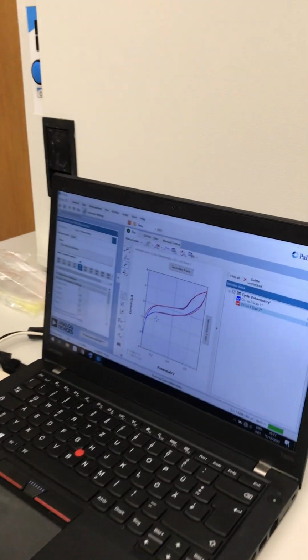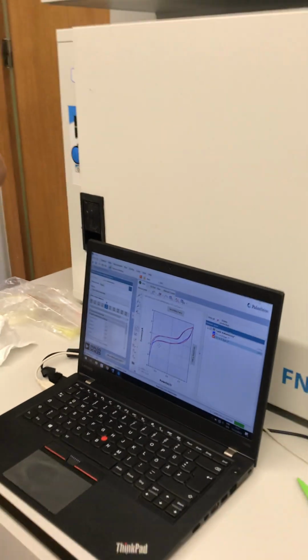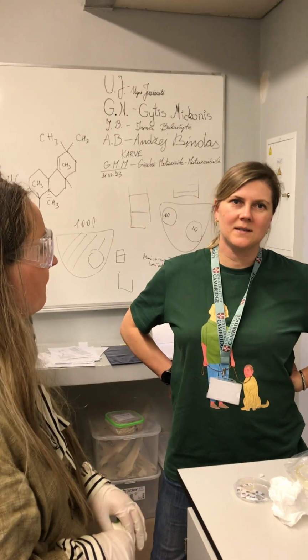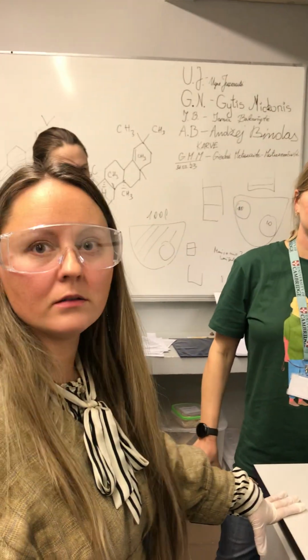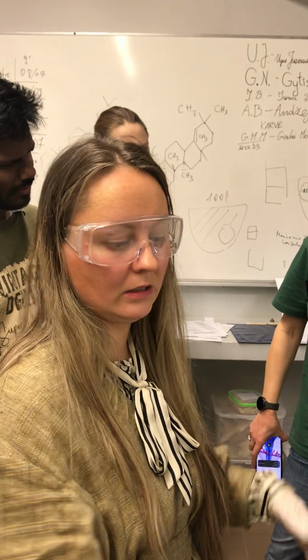And what does it say? Does it match? It's completely different. The profiles are quite different. We ran this, I will show you later. We can have chromatographs, gas chromatography, mass spectrometry. They stand on completely opposite sides, so we could explain using some mass spectroscopy what is happening here and compare to this technology.